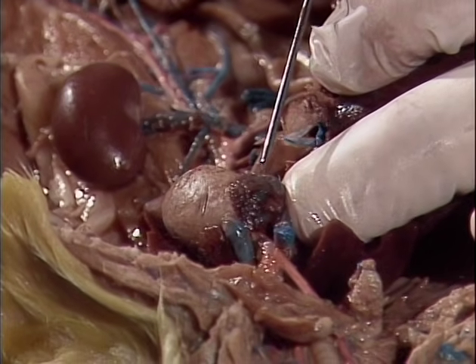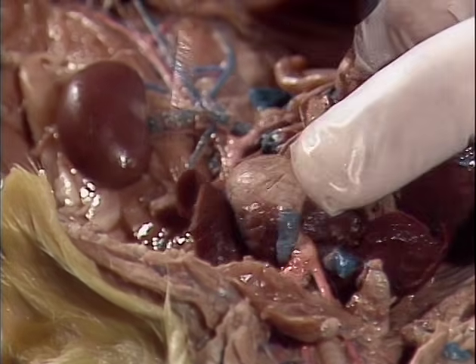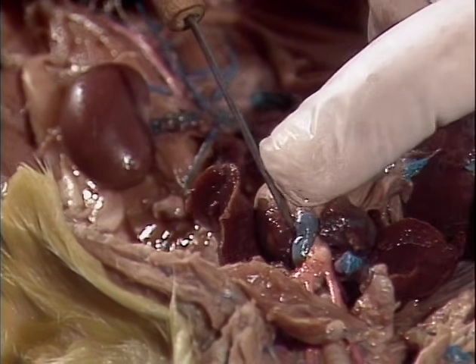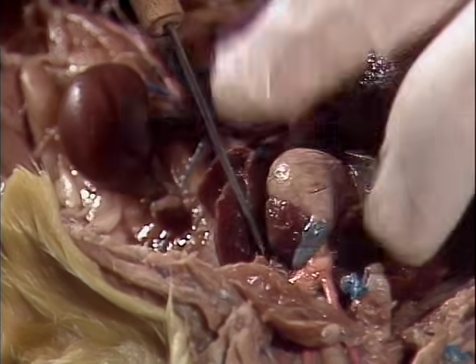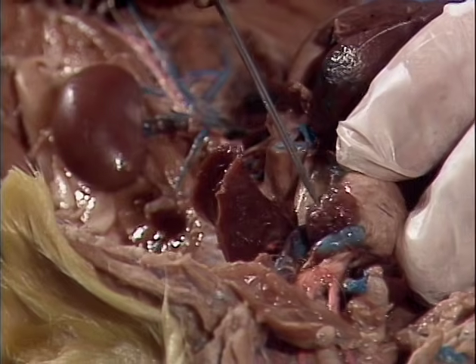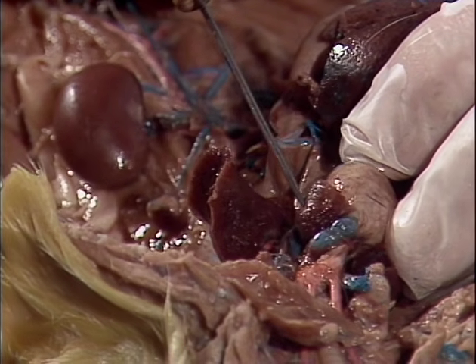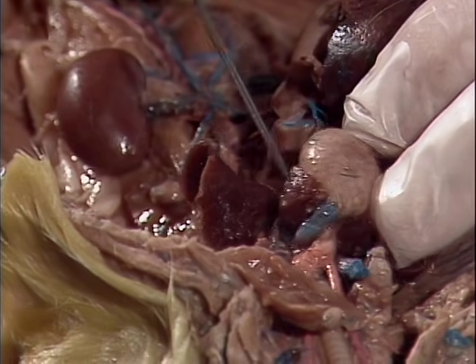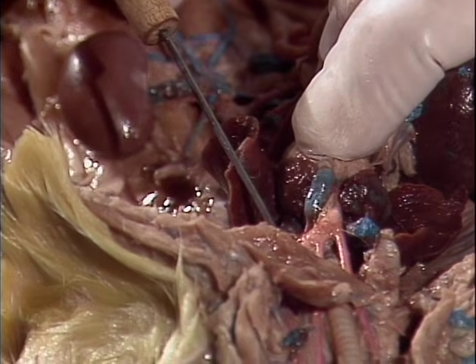of the heart. From the atrium of the heart, the blood will pass into the right ventricle, out through the pulmonary arch to the lungs, where it is oxygenated. It will return through the pulmonary veins to the left atrium, into the left ventricle, and out through the aortic arch to the rest of the body. This completes the circulatory system of the rat.